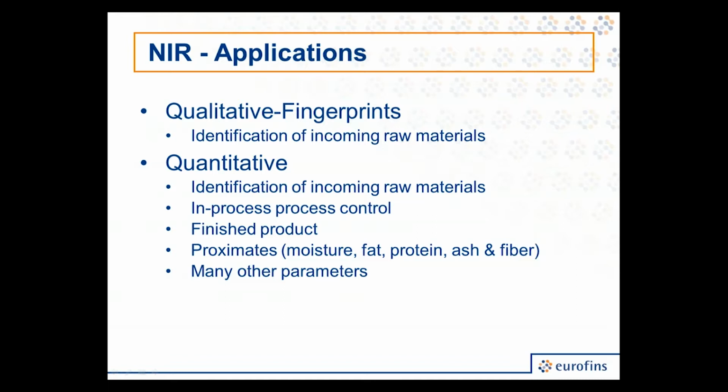Proximates, or protein, moisture, fat, and fiber content, are the most common parameters tested via near-infrared. However, there are many other traits to consider, such as pH, percent cook, peroxide value, color, and the list goes on. Some exceptions to be aware of in verifying label claims according to the AAFCO handbook are when it comes to trace amounts.